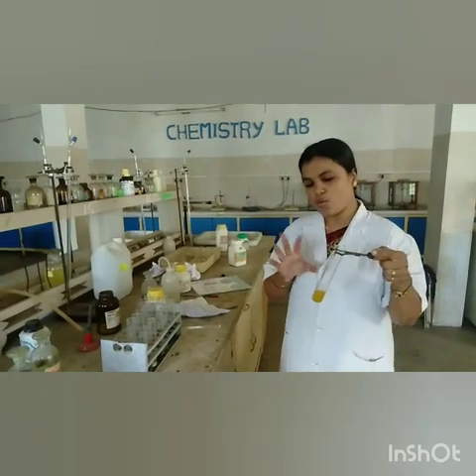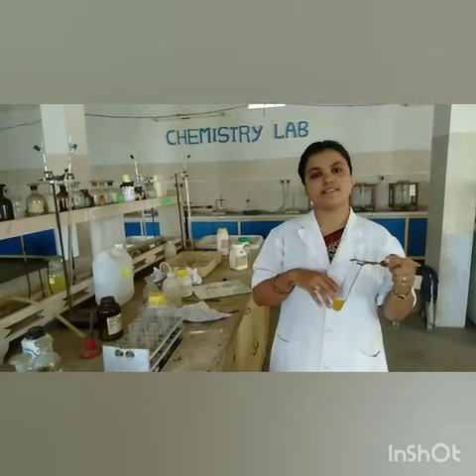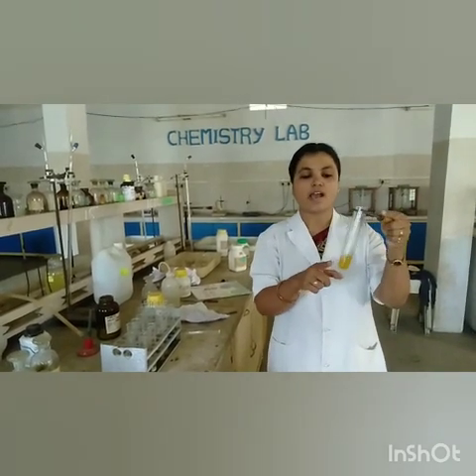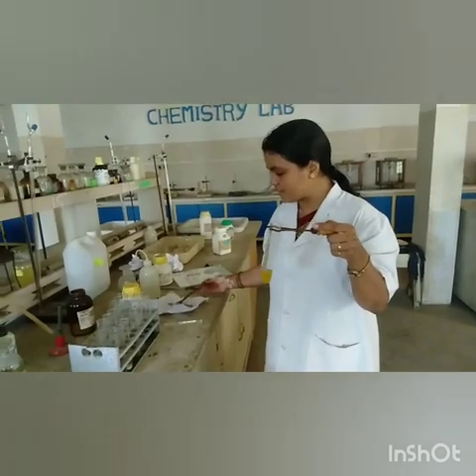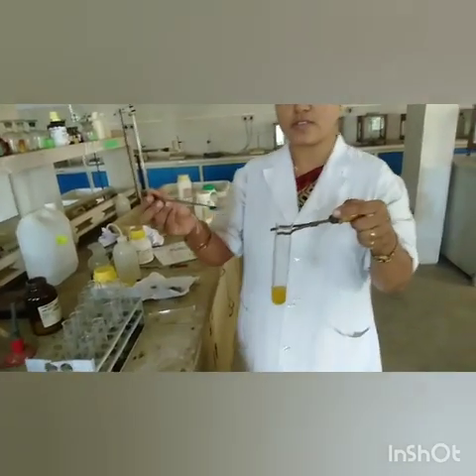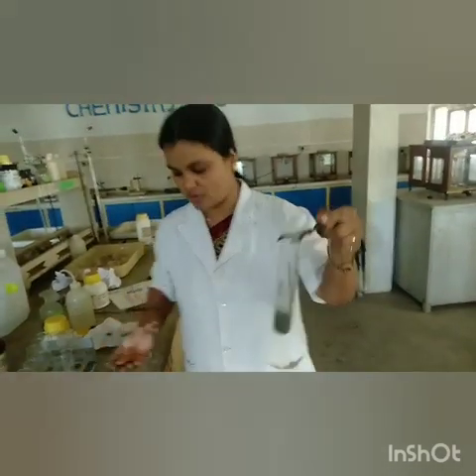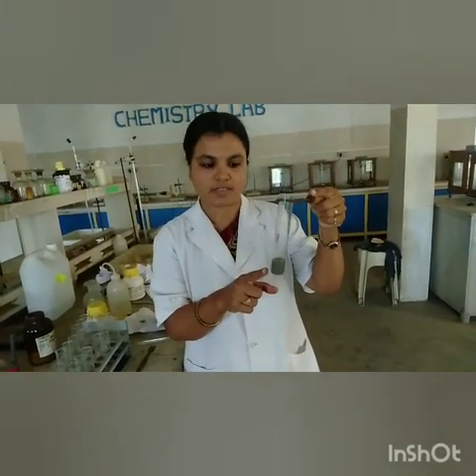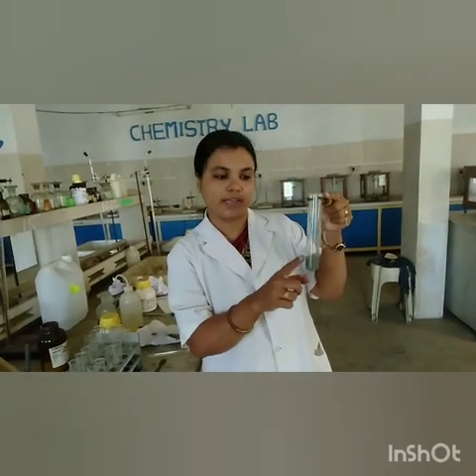Now let us see whether iron is more reactive or less reactive than aluminium. Here we have iron sulfate solution, in which I am going to put the aluminium metal. Can you see this is the metal and I am going to put it in this. So observe the color change again, children. What happened to the color? The pale green color of the ferrous sulfate changed to a grayish color.